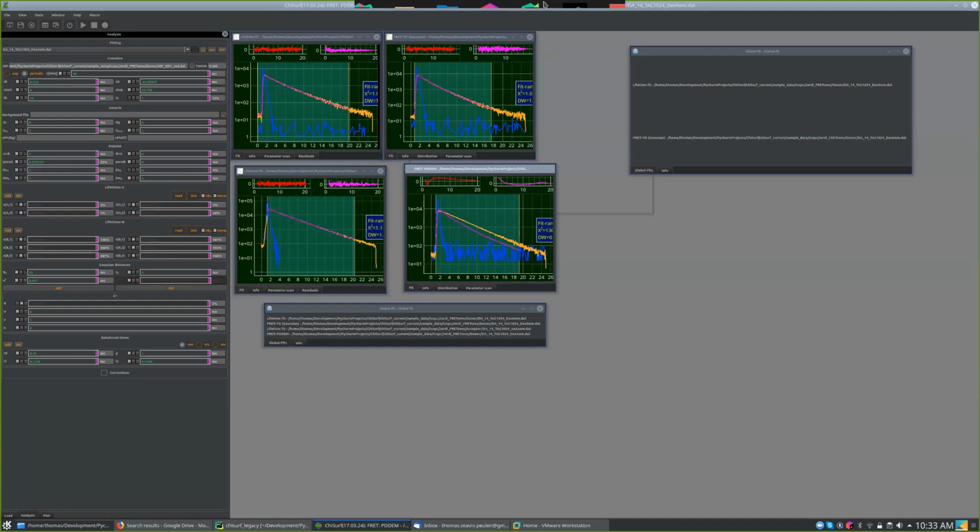So does it mean that the PUA and all this cross-section, crosstalk and so on has to be modified, right? So is there a possibility to calculate everything beforehand? Yes. Just with the spectra and the laser powers. Because for the excitation, of course, you need laser powers. This is the prefactor for how strongly you excite the acceptor. It depends on the spectra and the laser powers.